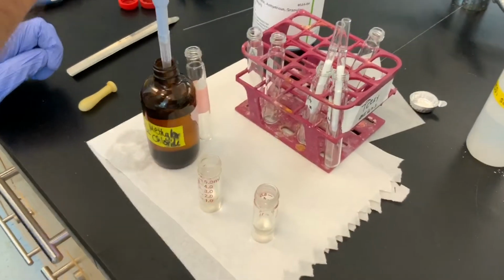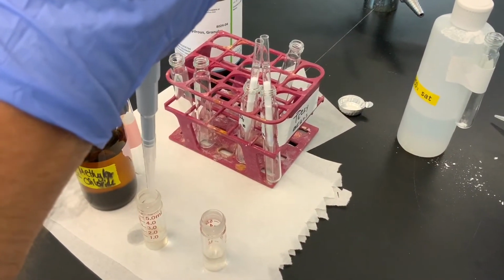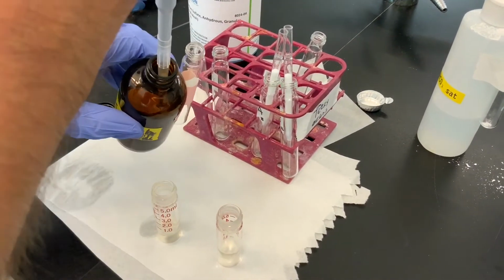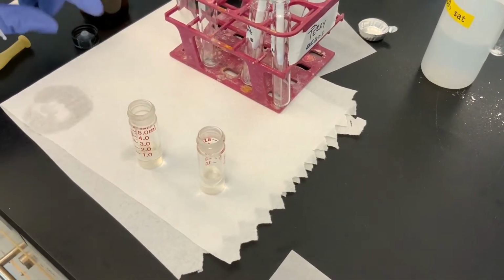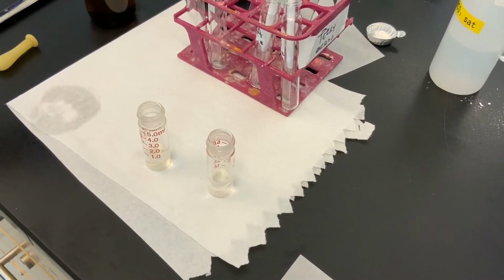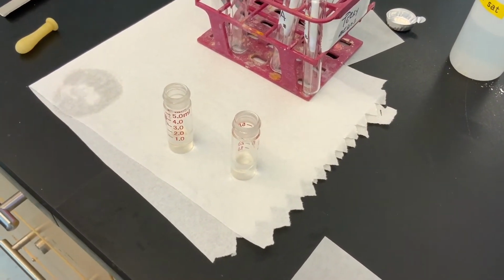Oh. All right, so we made a mistake twice. We used 800 microliters of water for part A, which should have been 600, and then you just saw me spill part B completely, so that was fun. So now we're starting over for both of them, but everything else I said is good. Hopefully it makes sense. So part A now, in here we've got 67 milligrams of benzoic acid. In part B, we're now dealing with 65. So I'll rewrite those numbers.